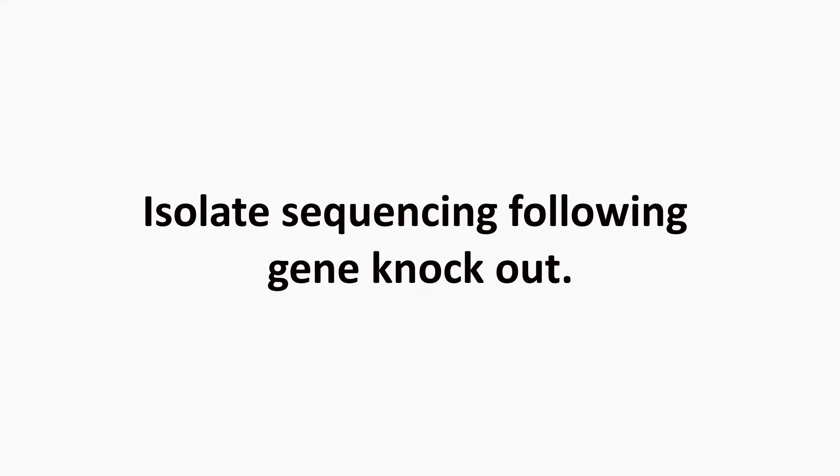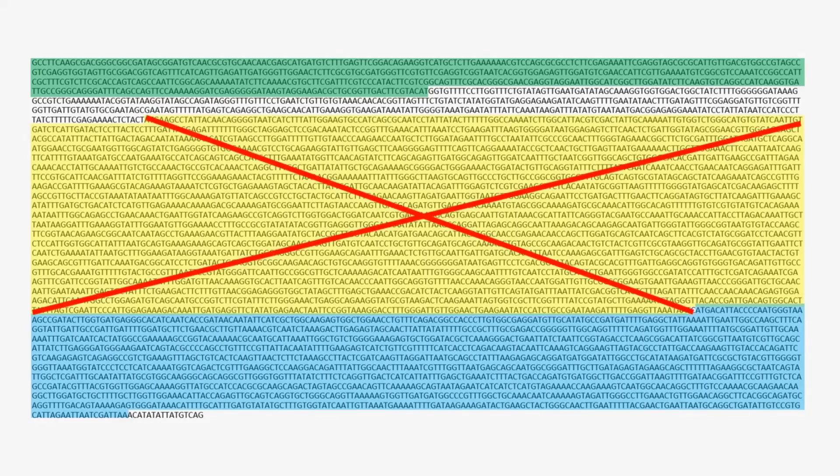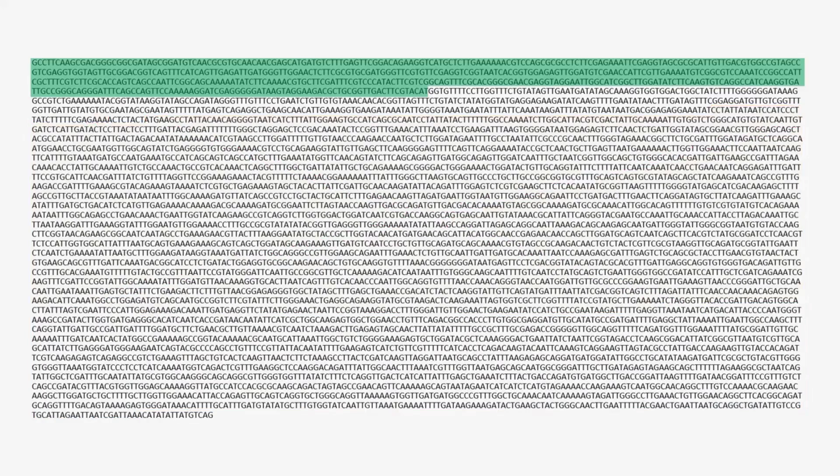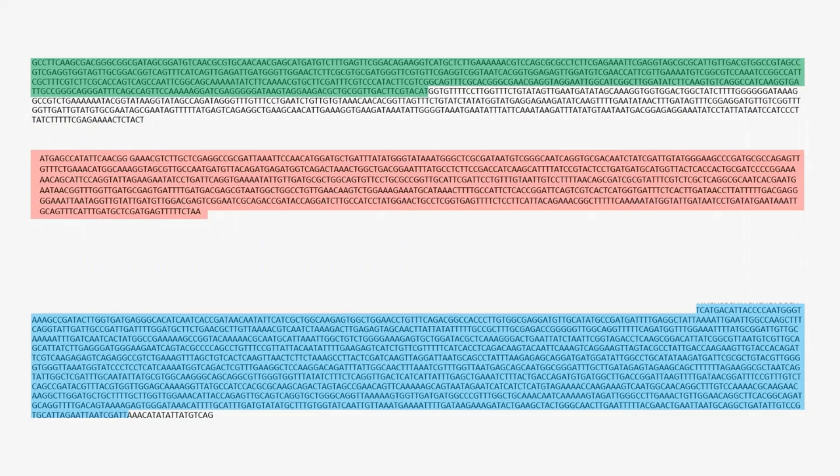This next part of the video looks at the sequence data. As a recap: there are three coding sequences predicted, highlighted in different colors. We want to knock out the gene highlighted in yellow, which has a ribosomal binding sequence and promoter that we will try to keep. The two flanking coding sequences can be seen with the gene of interest removed, and the red-highlighted sequence illustrates the kanamycin resistance gene to be inserted. Primers were also designed to retain a promoter sequence for the kan gene from our genomic sequence.